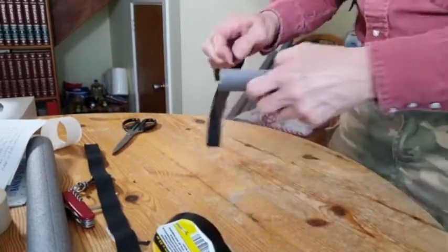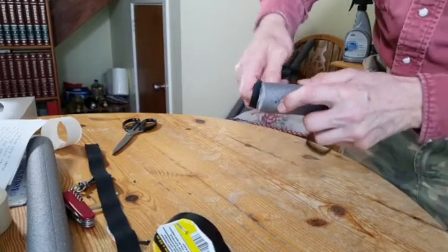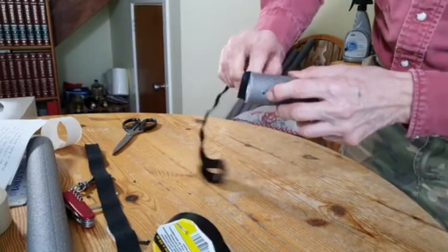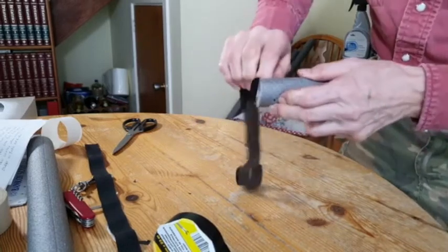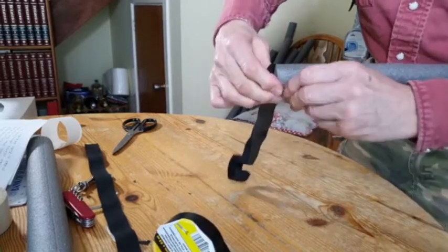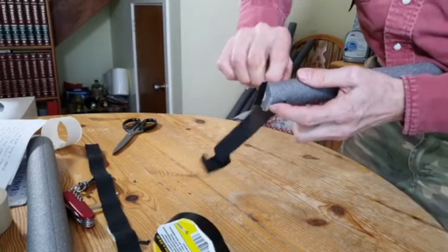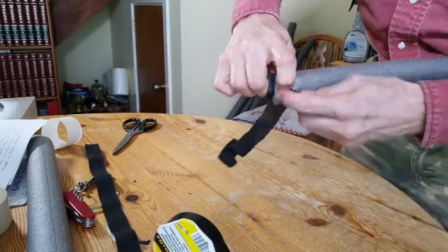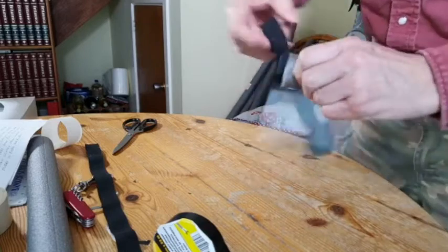Right, now you've got to get it through the hole. Start from this side, push it in, twist, twist, keep your finger near to the hole on the back, keep trying, keep twisting, keep pushing, and there she comes out the other side. Pull it through, try not to pull the tape off, so you need to keep twisting and pushing through. Don't forget the foam squashes a bit to help. Now you've got it through.